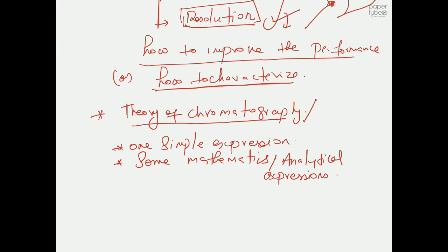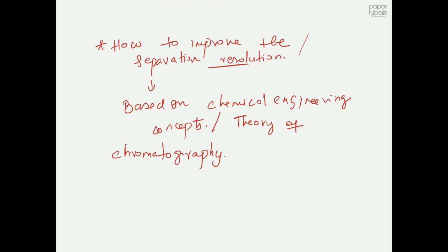And then I will show one simple expression related to the theory of chromatography. This one simple expression will help us to understand all the mechanistic events which happen when you perform a chromatography experiment. And then we will do a bit of mathematics. Whenever I say a simple mathematical expression, it will have some constants and some variables. So we will exploit that as one single expression, and then we will do some basic mathematics to solve a few problems. And this is very important. We will learn how to improve the separation resolution.